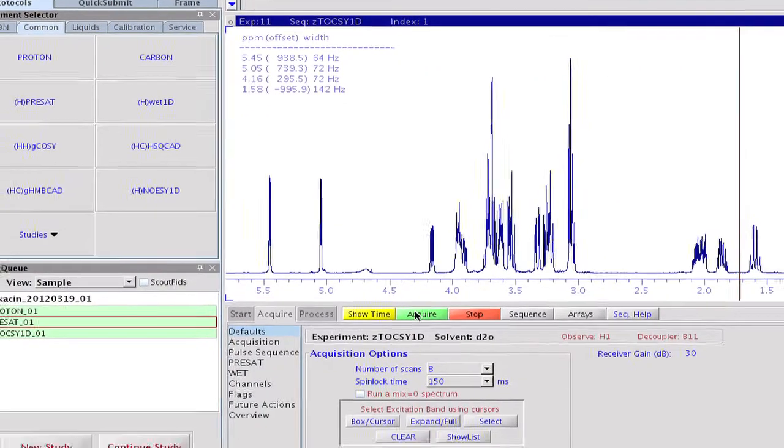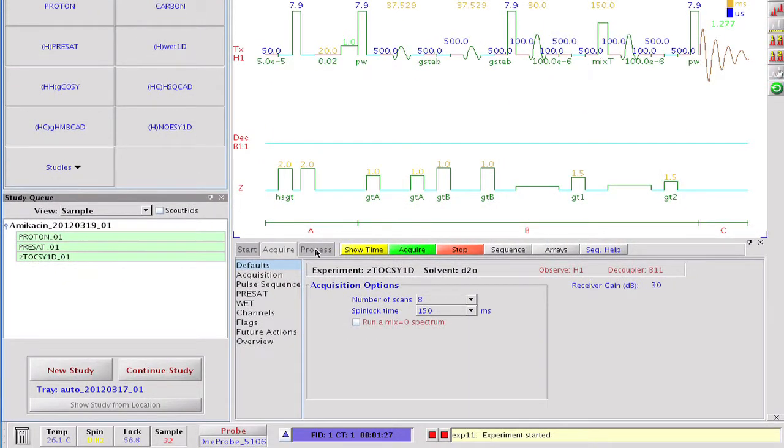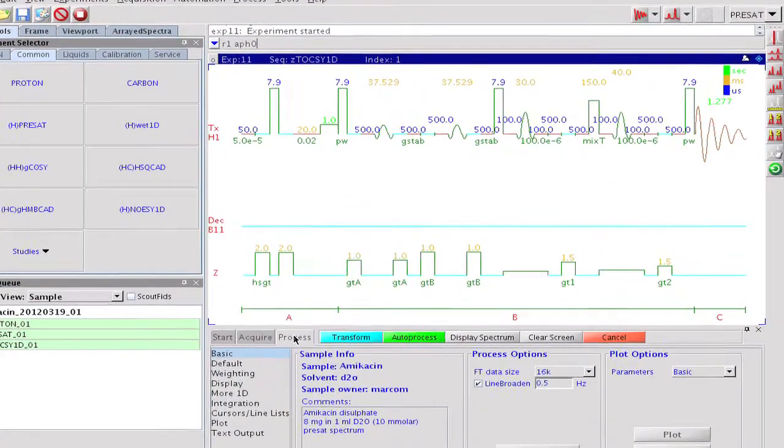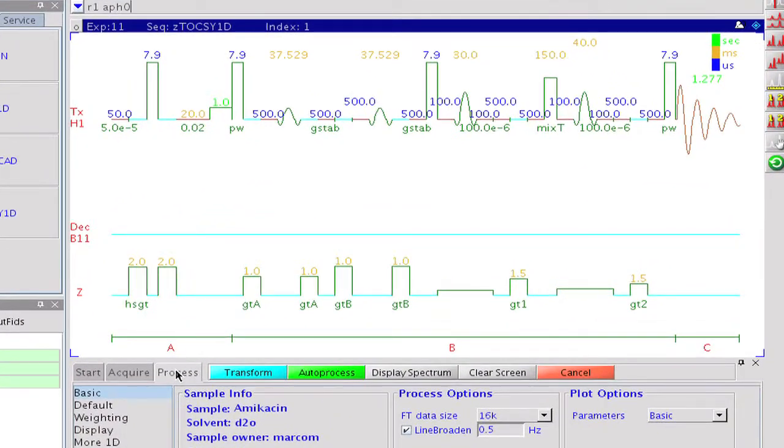When we click the Acquire button, all requested shapefiles are created by Pandora's Box, Agilent's powerful pulse shaping engine. The relevant parameters are updated, and the 4 datasets are arrayed before data acquisition begins. This complex procedure, which relies on perfect linearity of the RF hardware, is fully automatic and requires no operator interaction or extra calibration sets. While acquisition is running, the completed data files can be transformed at any time.